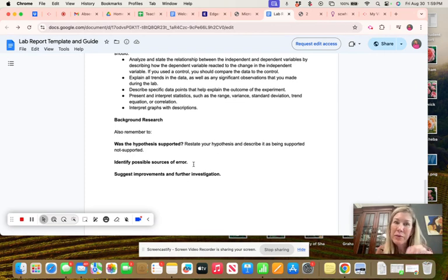And you had to keep that coil kind of loose so that oxygen could touch all the surfaces. But I had some student groups that wound it really tight in a little coil and placed it in there, so oxygen couldn't interact with all surface area parts. So at the end of the lab, their yield was a number that was off from what they expected. And that's just because they had coiled it too tight.